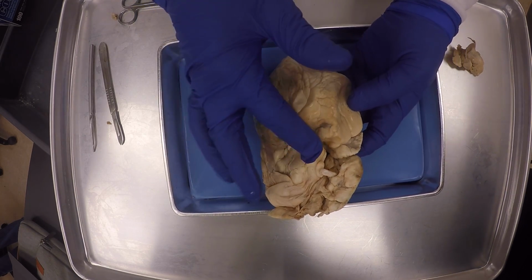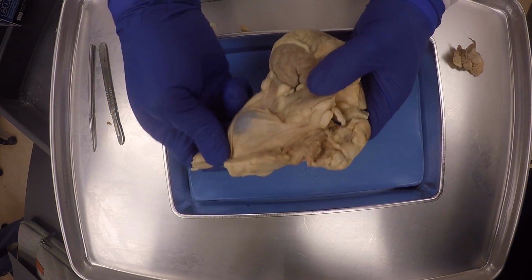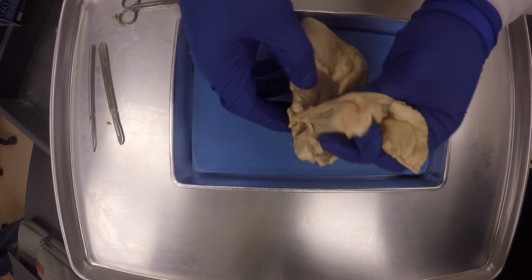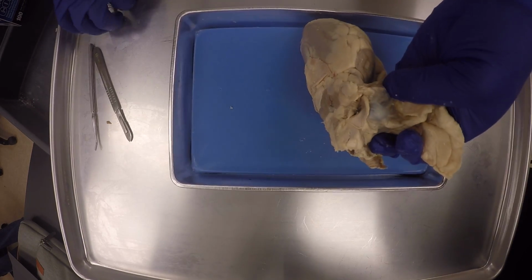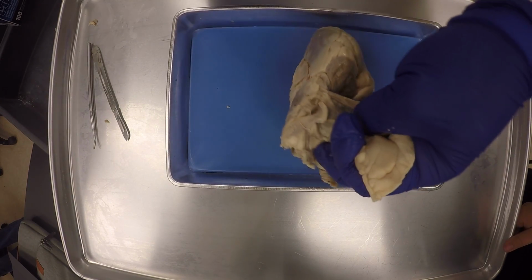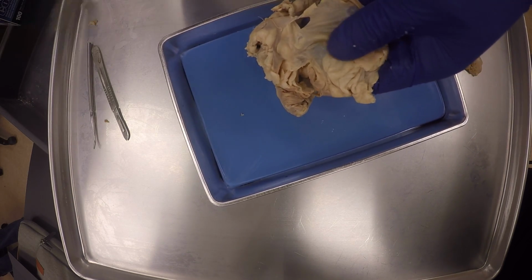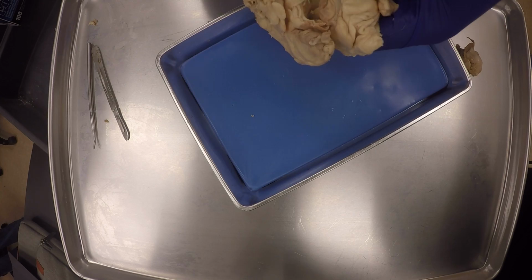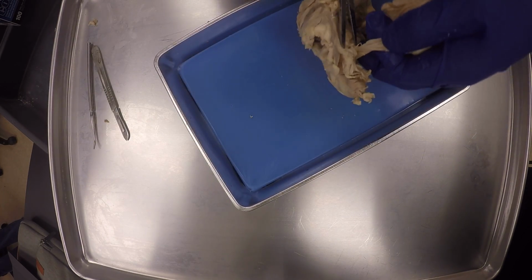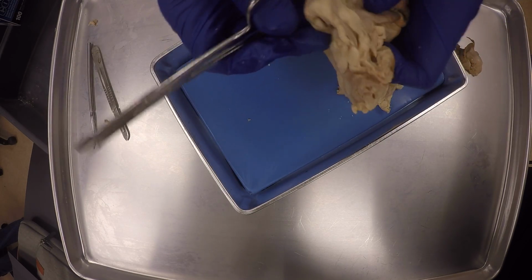Okay? And you can confirm that indeed this is the right side because of the pulmonary trunk. Remember, the pulmonary trunk is coming from the right ventricle. You see what I'm saying? So if you put a straight object like a wooden dowel, in this case I'll put my probe in there, I'll be probing and it will hit the right ventricle. You see what I'm saying?